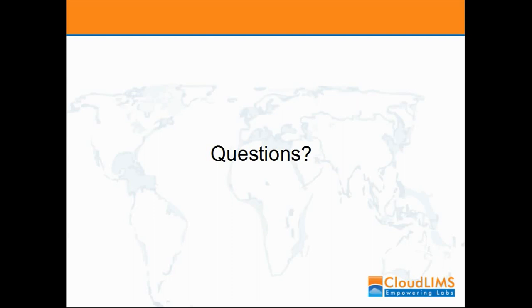The first question that we received is, how is a cloud-based LIMS a technologically advanced alternative to on-premise LIMS?